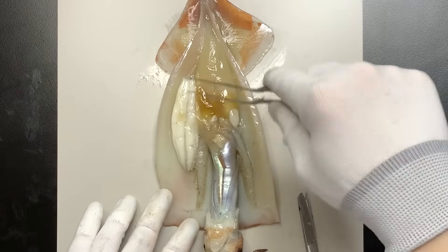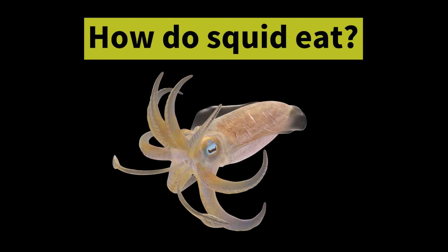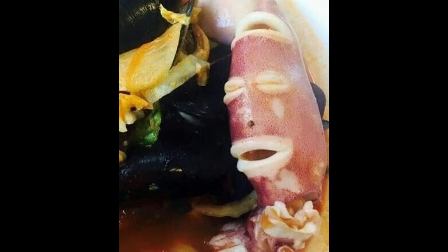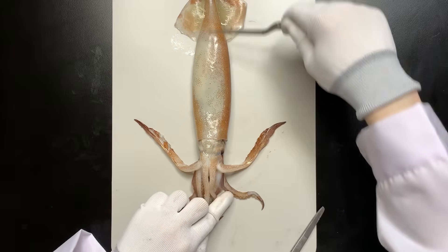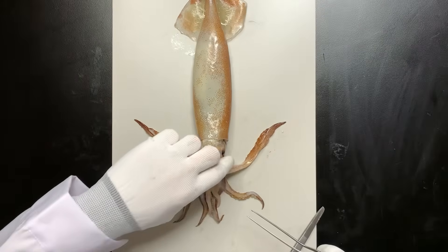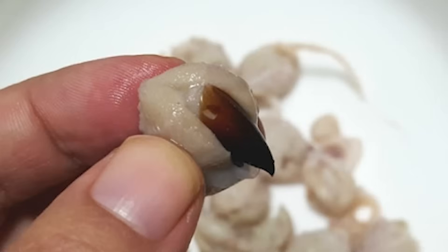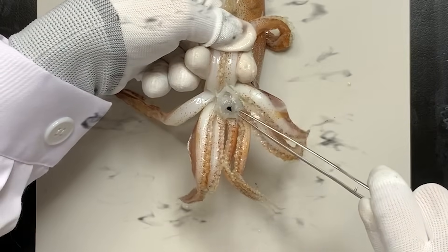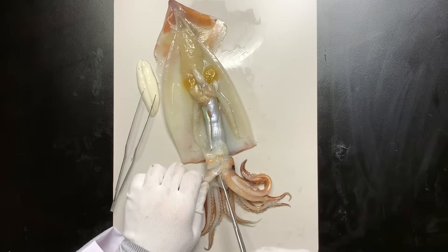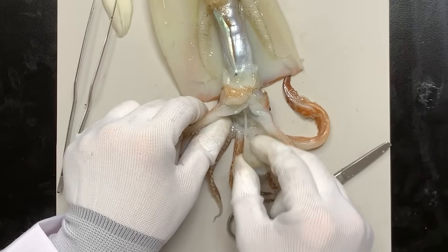This squid is a female. These are the eggs, and above them is the gonad. Where's the squid's mouth? When a squid catches prey, it grabs it tightly here. Many think the funnel is the mouth, but it's not — the mouth is located in the center of the arms. The squid's mouth, or beak, looks like a bird's beak. They also squirt ink, which led people in the past to nickname them 'crow-eating fish.' If you cut around the squid's mouth, you'll see the esophagus leading to the upper digestive tract.